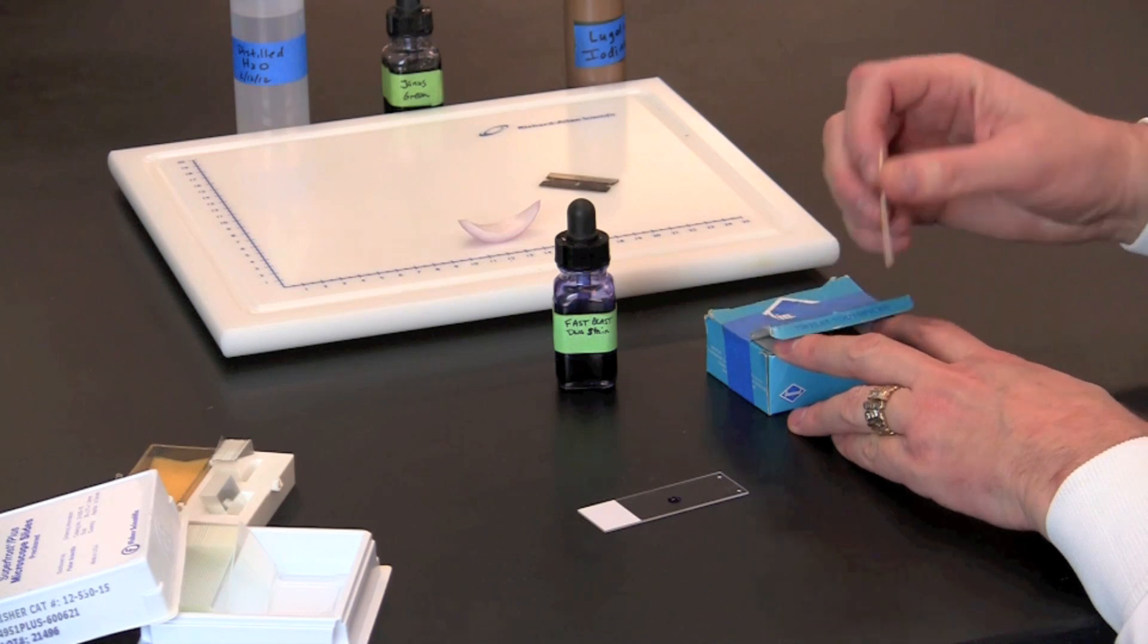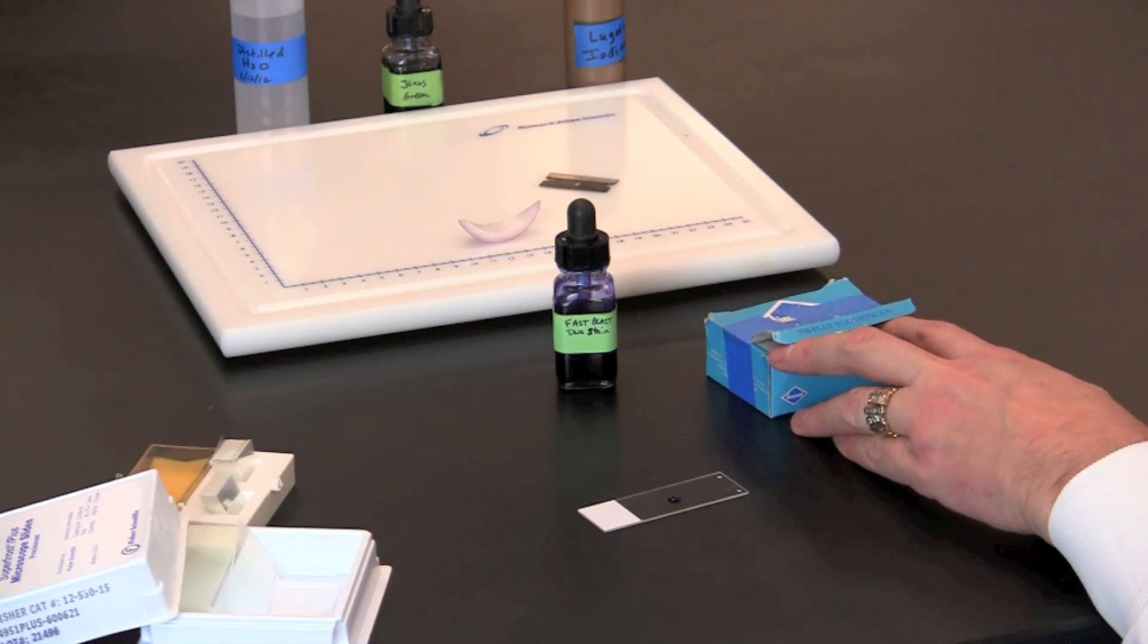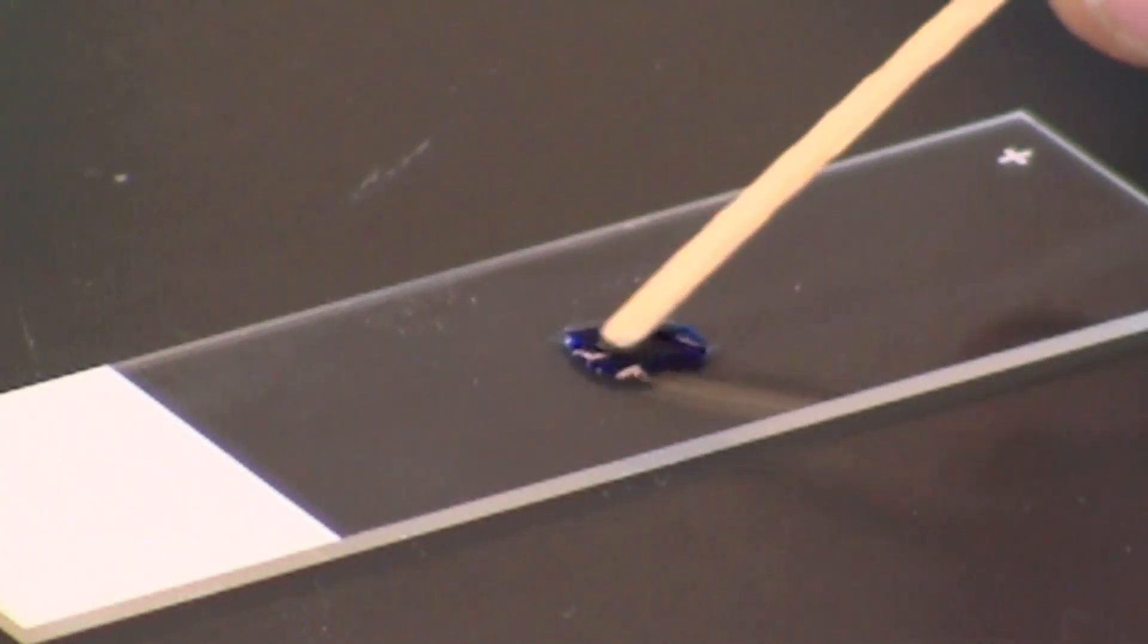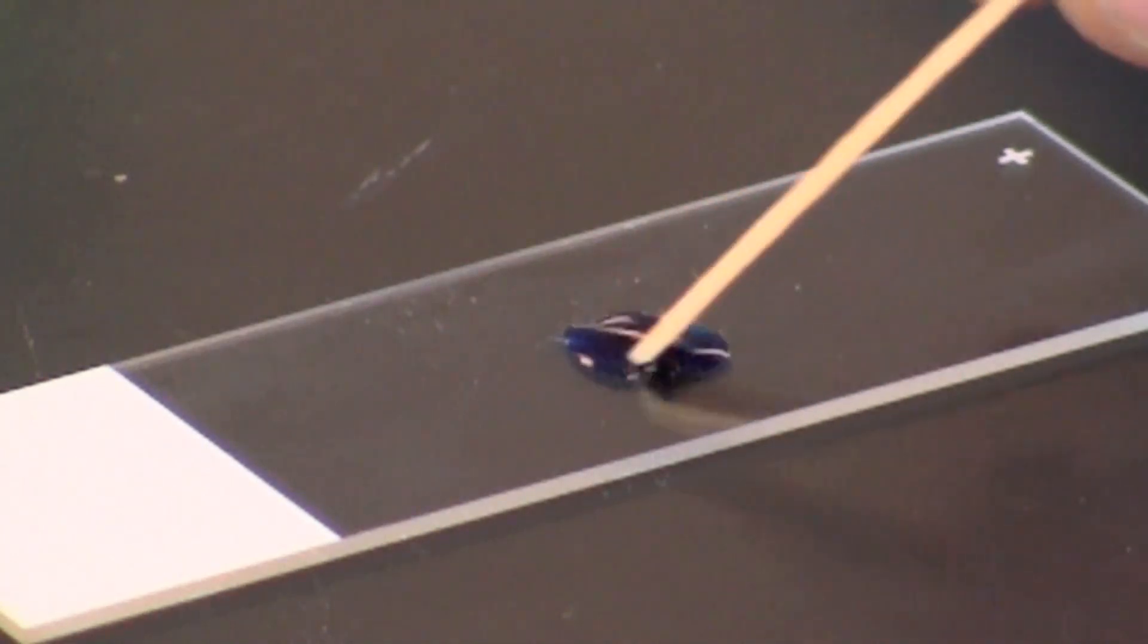Use the blunt end of a toothpick to scrape the inside of your cheeks. Place the toothpick into the drop of stain on the slide and swirl it to release the cells into the stain.